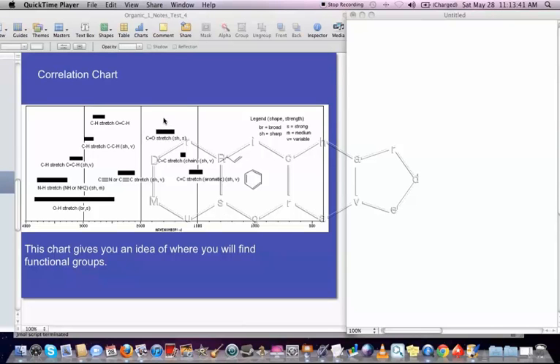As I said in the intro, what we know about infrared spectroscopy is that certain frequencies of infrared light will interact with certain functional groups at predicted frequencies. So I'm going to go through the correlation chart from about 3500 down to about 1500, because in this particular region we can come up with functional groups that will be what I'm calling diagnostic. If we see peaks in this region, then we know that we have the functional groups that correspond to those frequencies.